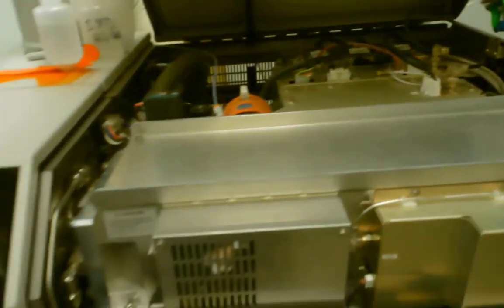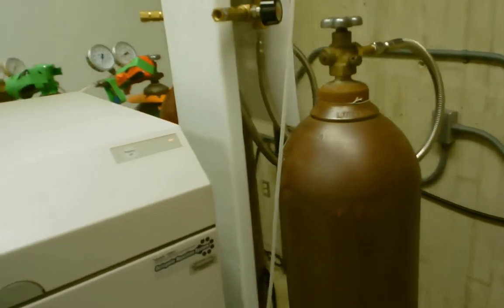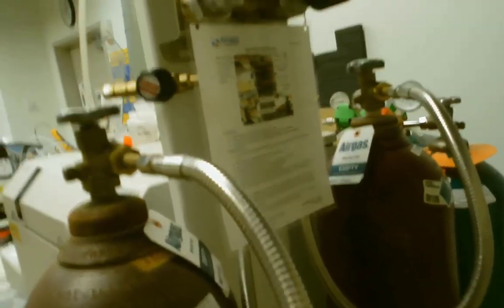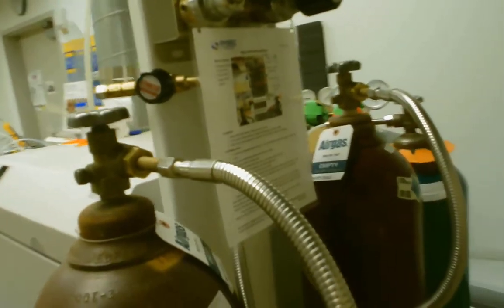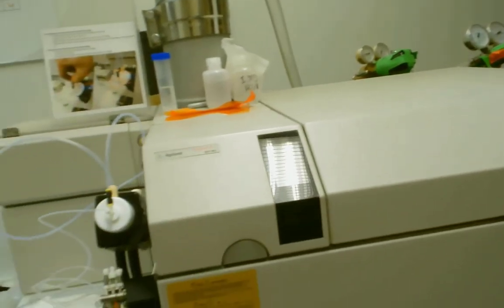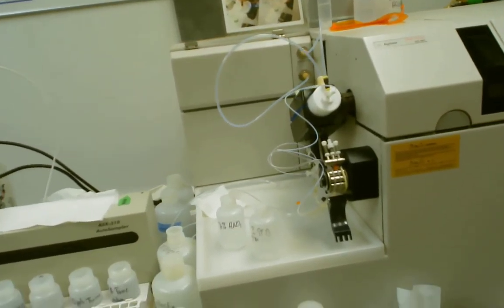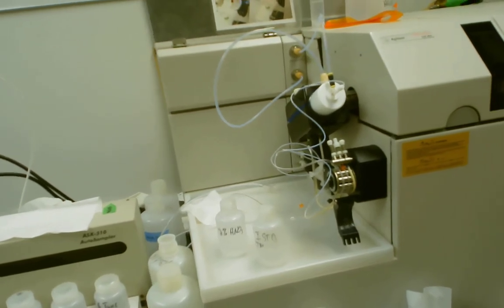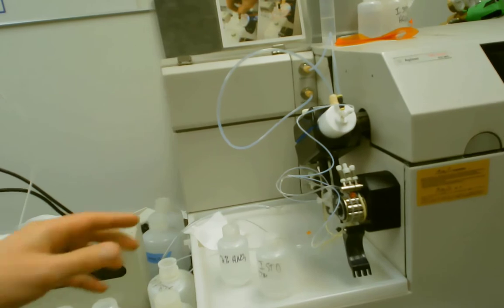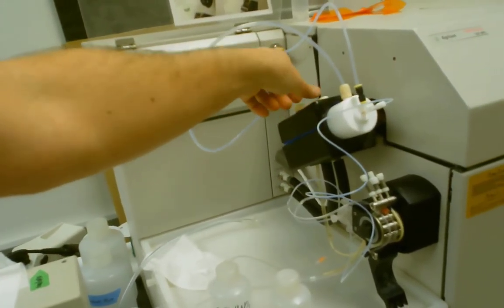And so the system, as I mentioned, uses a lot of argon. So on the end, we have a dual argon manifold. This manifold allows us to hook up two different argon tanks so that we will never run out of argon during a run. The system also requires a water chiller to cool down the cone that the plasma is directly hitting, as well as to help cool down the Peltier device that is cooling the spray chamber down.